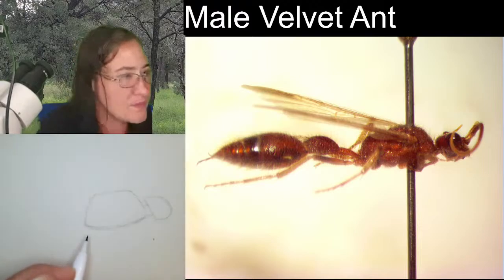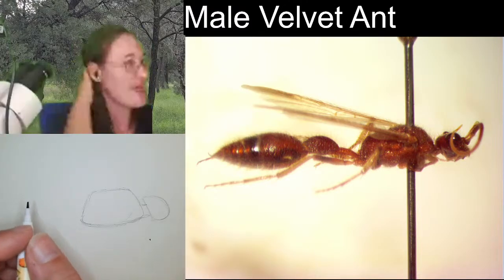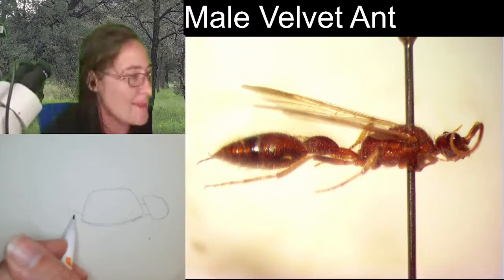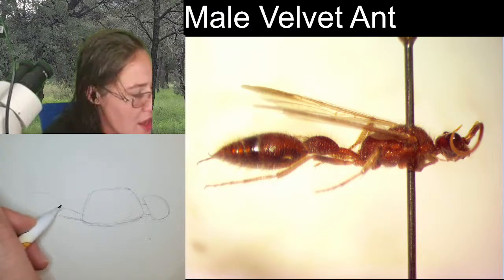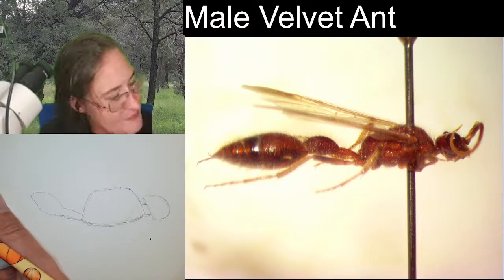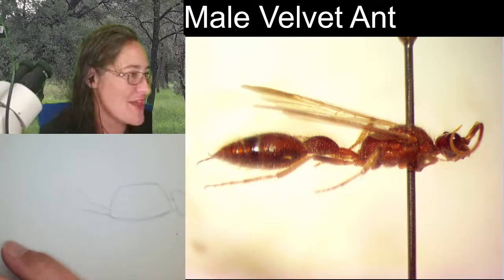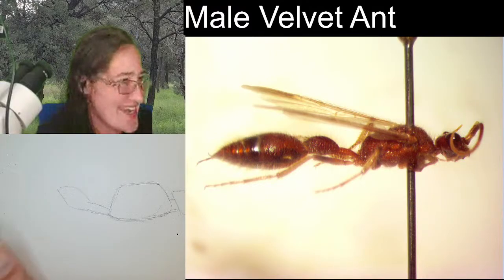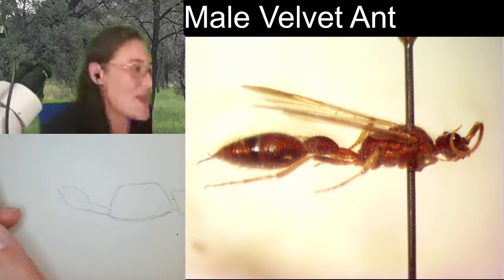All right, so from the mesosoma, we have that very, very familiar wasp waist happening. Connected at the base, we're going to be coming out as so. And then there are two, how do we call these? Nodules? There's a constriction right here, which I think is kind of nifty. So we've got that narrow wasp waist. It's coming up, arching up. And then we have this abdomen here.